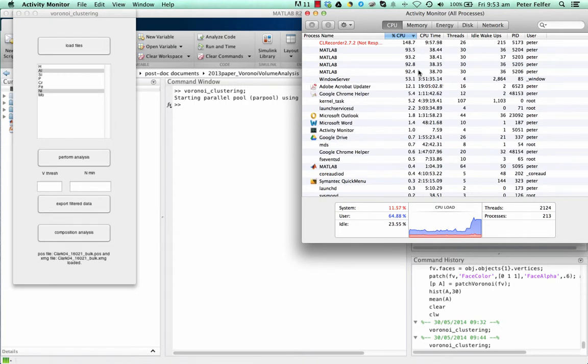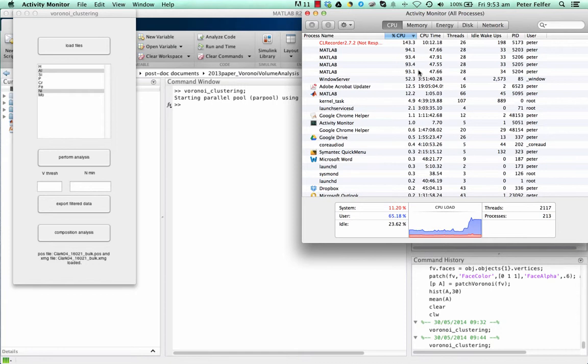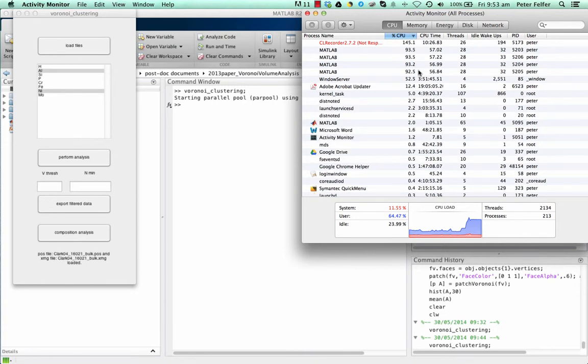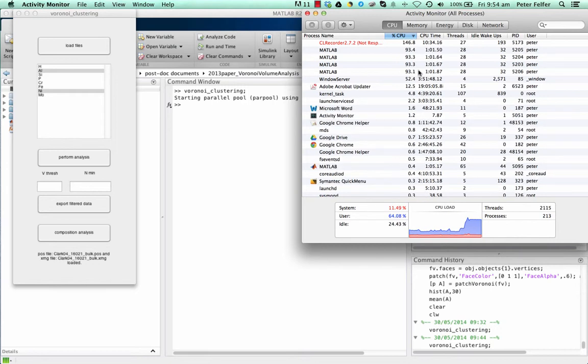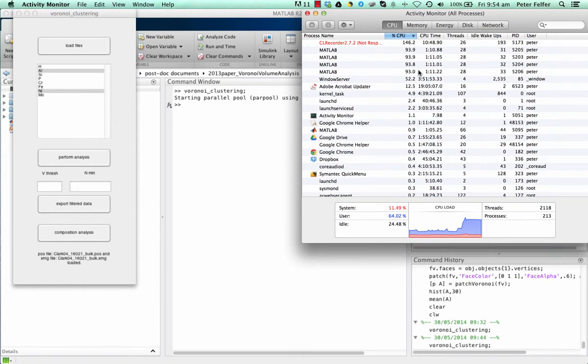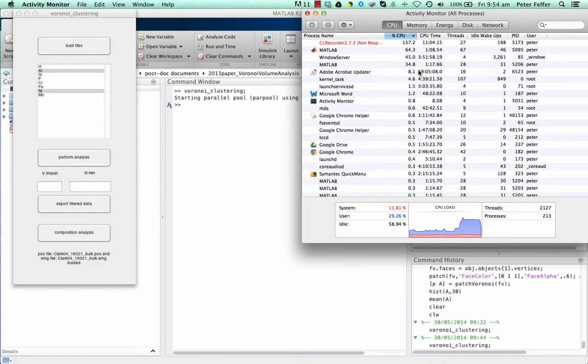After the analysis was performed, which means we're calculating the Voronoi volumes of the atomic distribution, then we're calculating the Voronoi volumes of an equivalent distribution. We're taking a random sample out of the entire data set that contains as many atoms as the cluster test sample that we're doing. We're randomizing the atomic distribution by random labeling. The purpose of that is simply so that we have a reference, so that we know what random is, and we can distinguish whether what we're getting is random or non-random.